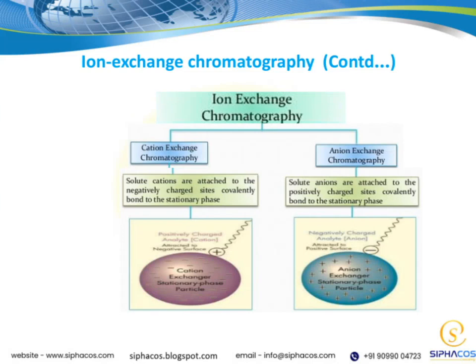Now let's continue exploring ion exchange chromatography. As we discussed earlier, this technique is all about using charged resins to separate ions and charged molecules based on their affinity for the resin. On this slide, we see that the process is often extended or refined, which is why we refer to it as "cont." or continued. The key idea here is that ion exchange chromatography can be tailored to separate a wide range of ions, from small inorganic ions to larger biomolecules, by choosing the appropriate resin.